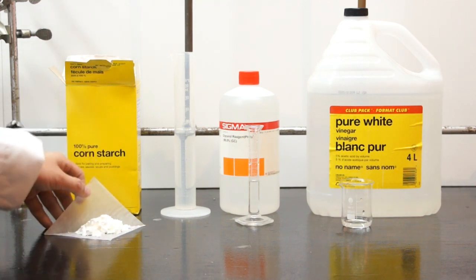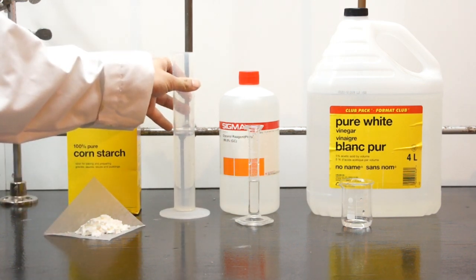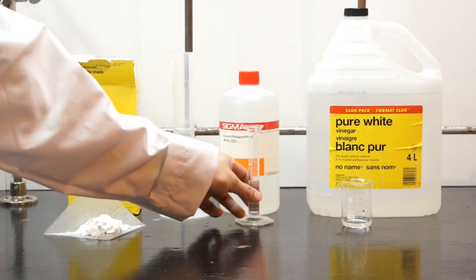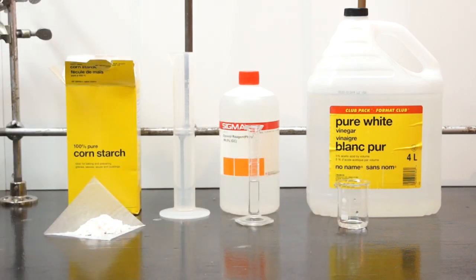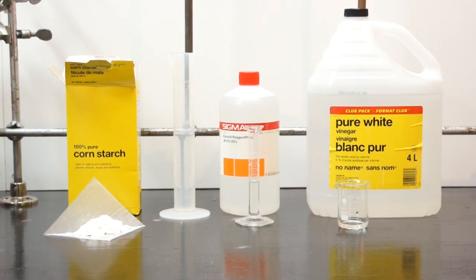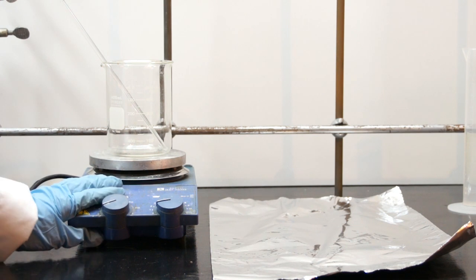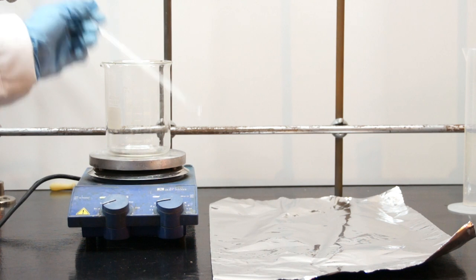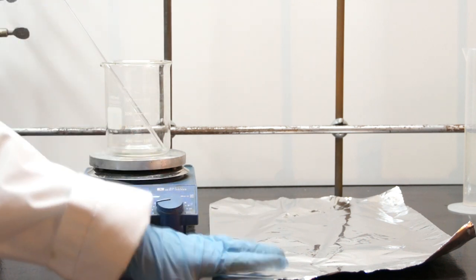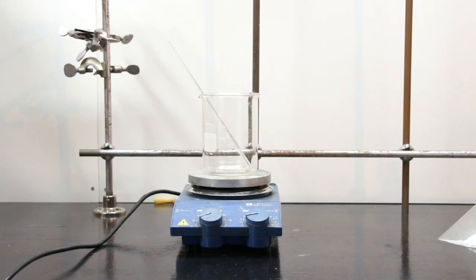For this experiment, you're going to need 9.5 grams of cornstarch, 60 milliliters of water, 5 milliliters of glycerin, and 5 milliliters of 5% acetic acid in water, or vinegar. You're also going to need a hot plate, a beaker, a glass stirring rod, and either tin foil, wax paper, parchment paper, or a silicone baking sheet.